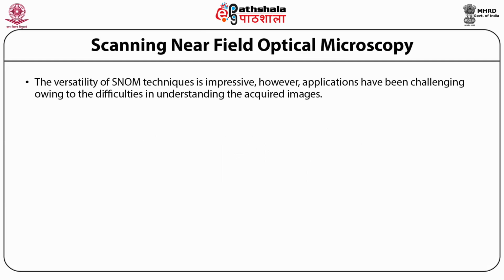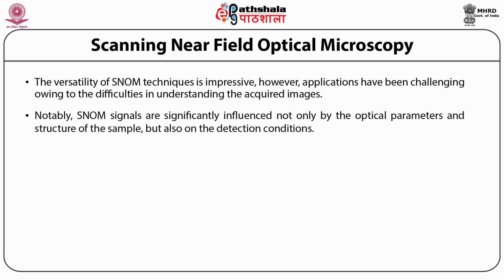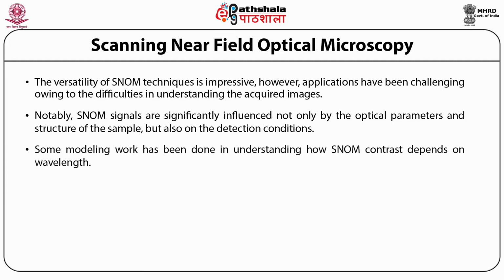The versatility of SNOM techniques is impressive. However, applications have been challenging owing to the difficulties in understanding the acquired images. Notably, SNOM signals are significantly influenced not only by the optical parameters and structure of the sample but also by the detection conditions. Some modeling work has been done in understanding how SNOM contrast depends on wavelength.